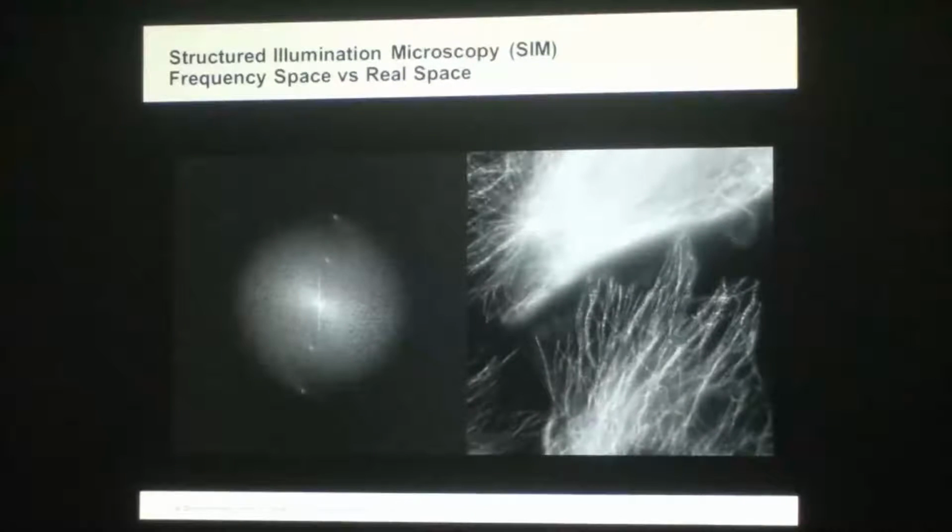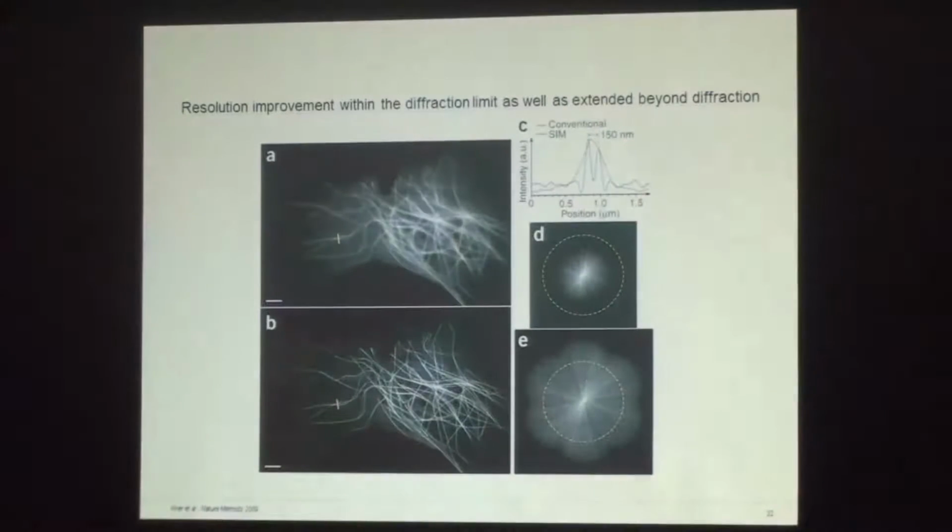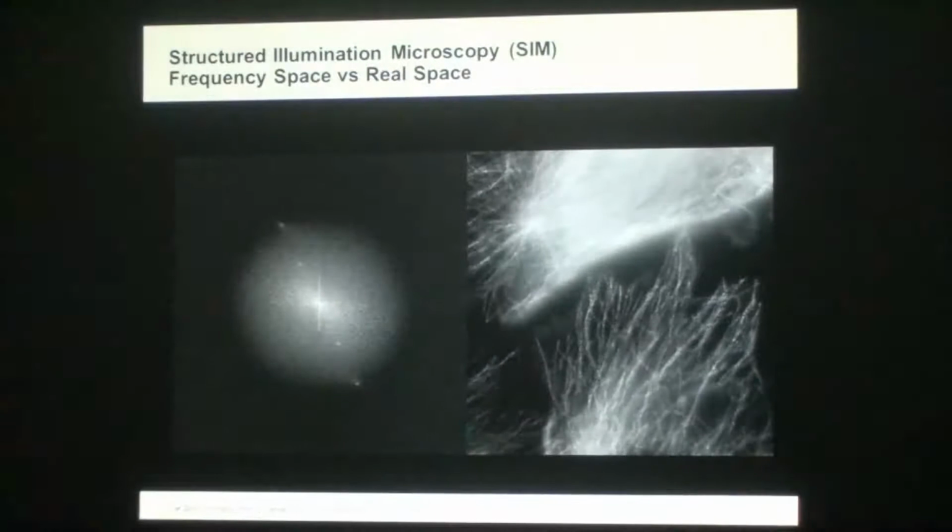So here, this is a typical rendering of what the microscope sees on the image, and what is happening in the background of that when the calculation is made in the frequency space. As you can see, this is the typical frequency raw data, where you see the actual frequencies collected, and these are when the grids are patterned illumination. Here, Zeiss uses specific grids, and I'll be showing that in a second, where you can see what are the available angles. When you rotate the grid in real time, this is how it looks in the normal live view in the microscope.